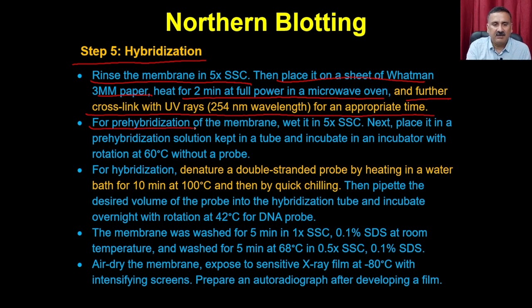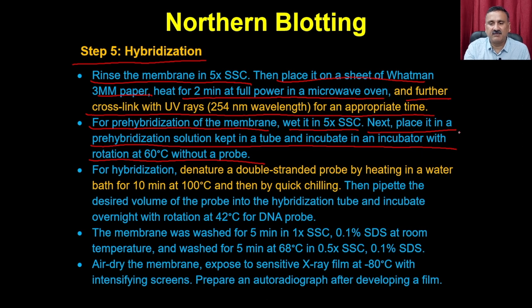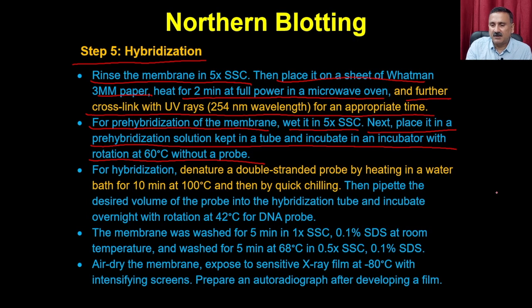Then for pre-hybridization of the membrane, wet it in 5x SSC, next place it in a pre-hybridization solution kept in a tube and incubate in an incubator with rotation at 60 degrees without probe. Remember that most of these steps have already been discussed, that you require a hybridization chamber. And the hybridization chamber has a tube like this, and this tube will go into a hybridization chamber.